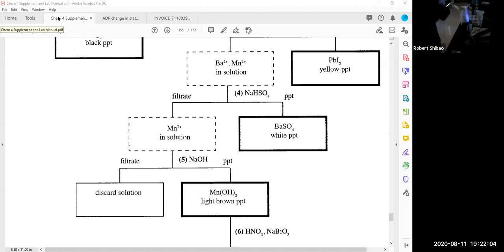And so what you do is you don't want to heat it on the hard part of the flame. The hard part of the flame is right at the tip of the cone. Glass takes a lot of temperature to soften, but you could heat it here. Actually, take a look at the color of the flame. Do you see the color of the flame? You know what that color is from? The yellow flame is not because of a lack of oxygen. This yellow flame is because of sodium ions. If you sprinkle salt in a flame, you'll get this yellow flame, and that yellow flame is due to sodium atoms being excited.